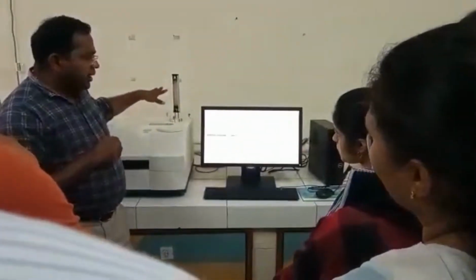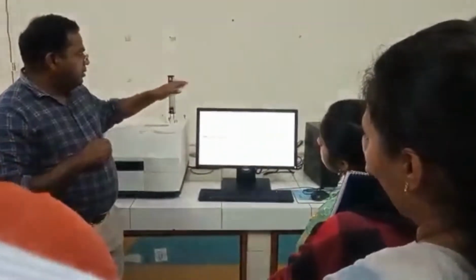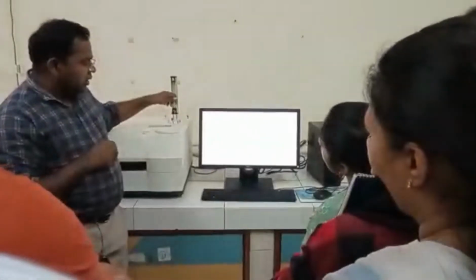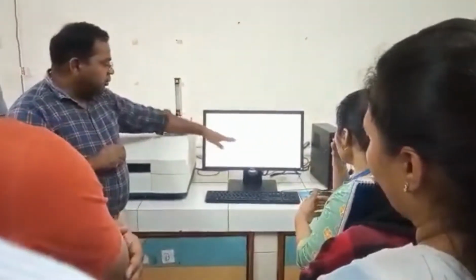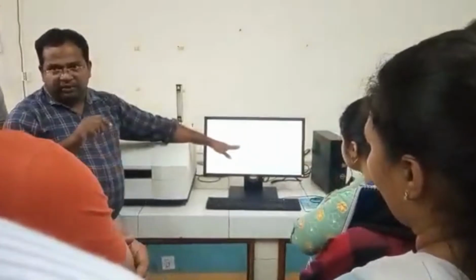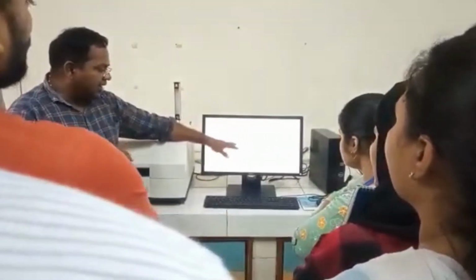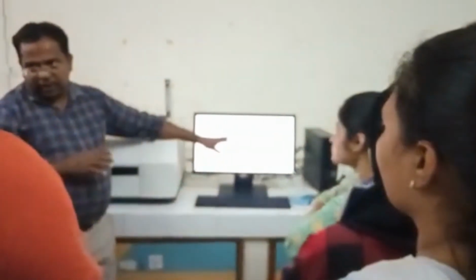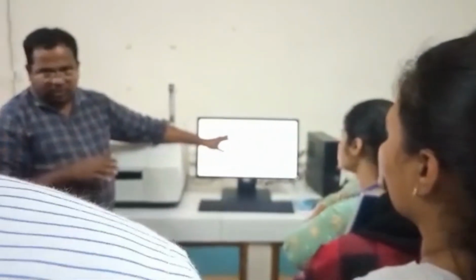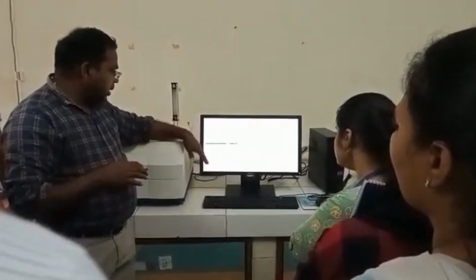Here we are using the nitrogen with the manual flow controller. So the nitrogen we have to set every time manually. Apart from that, there is an optional mass flow controller which is also provided in some cases. There in the software itself you can set the flow rate. The machine itself will control the flow. Okay. Here just for information purposes you can put the flow rate of the nitrogen. Otherwise nothing to do with the machine. Okay. So this much will be the temperature program.